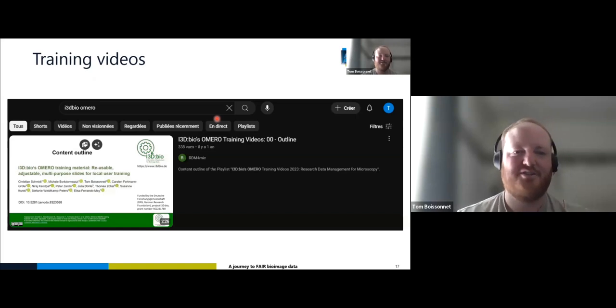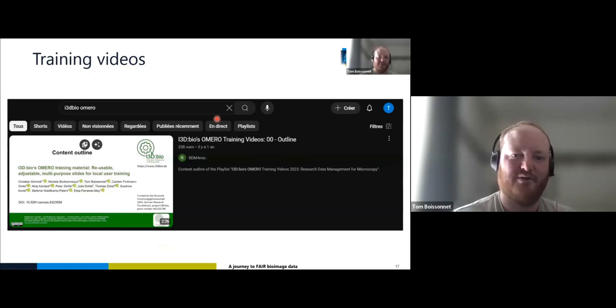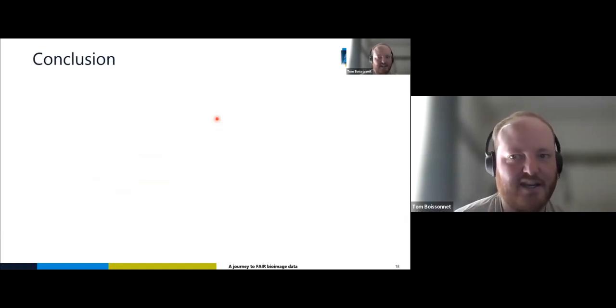I want to mention that I'm not doing a full tutorial on OMERO right now. If you're interested in more content on how to use OMERO, you could use, for example, YouTube. We have a series with i3D training material there that you could use. But if you simply type OMERO, I'm sure you would find a lot of very interesting resources.